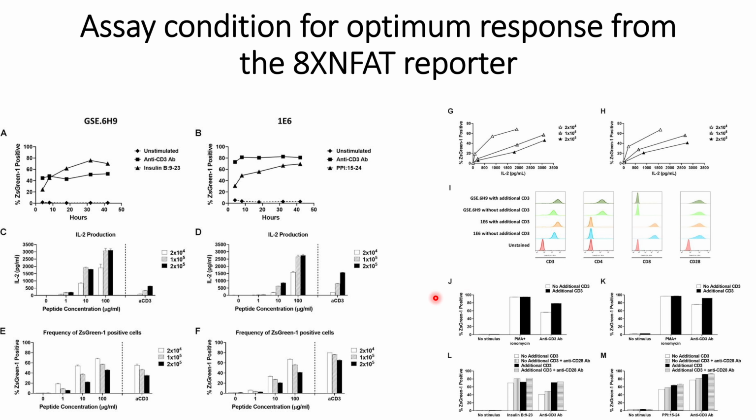And thereafter they checked the ZsGreen positive signals through the anti-CD3 antibodies and also through the chemical stimulator, that is PMA plus ionomycin. With PMA plus ionomycin, the signals with and without CD3 addition remain the same.